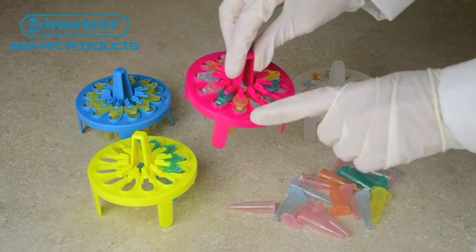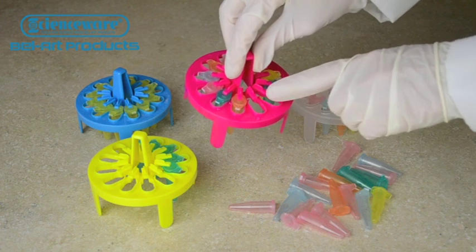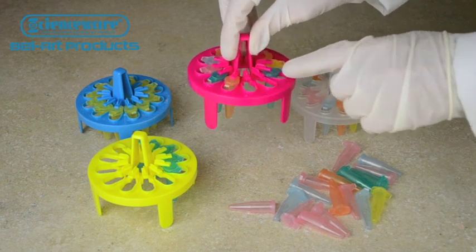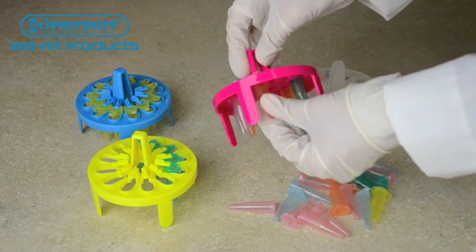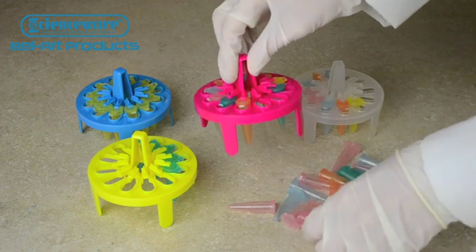PrepSafe Microcentrifuge Tube Mini Floating Racks have unique immobilizing tabs that protect your samples from loss and contamination by locking your tubes in place and keeping caps closed.